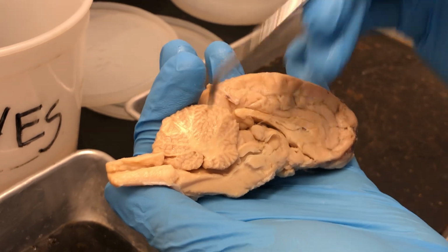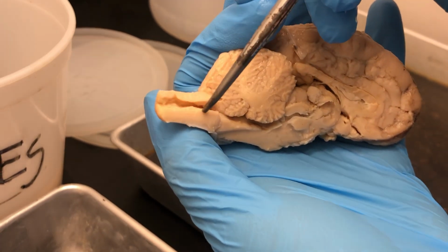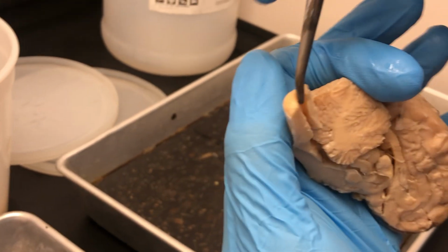Then last one, the central canal. I'm going to try to put this back together, but this is the central canal here. It is a little ripped apart, but that is the central canal, that little hole there.